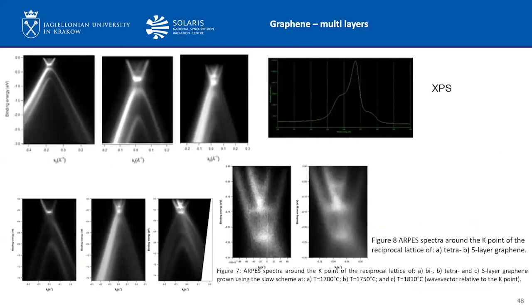Okay, I think that is graphene, and we can present many spectra, but I think it's better for you if Marcin presents the IGOR procedure and shows you how to interpret and analyze data.